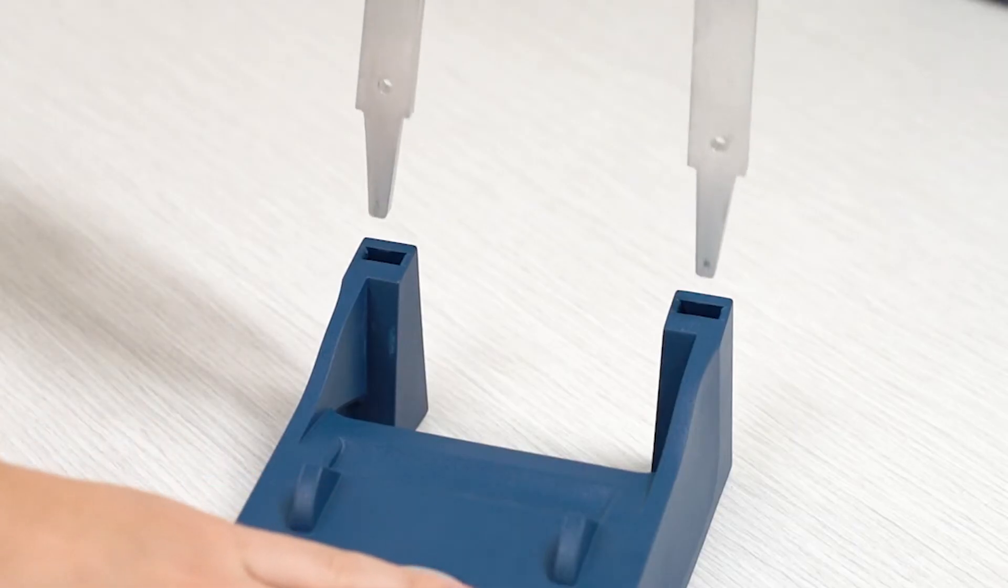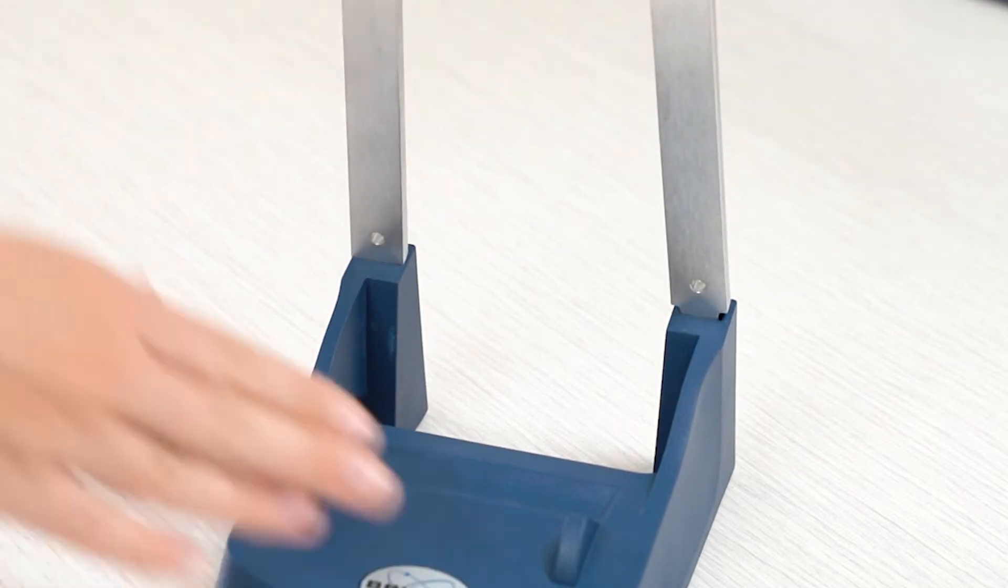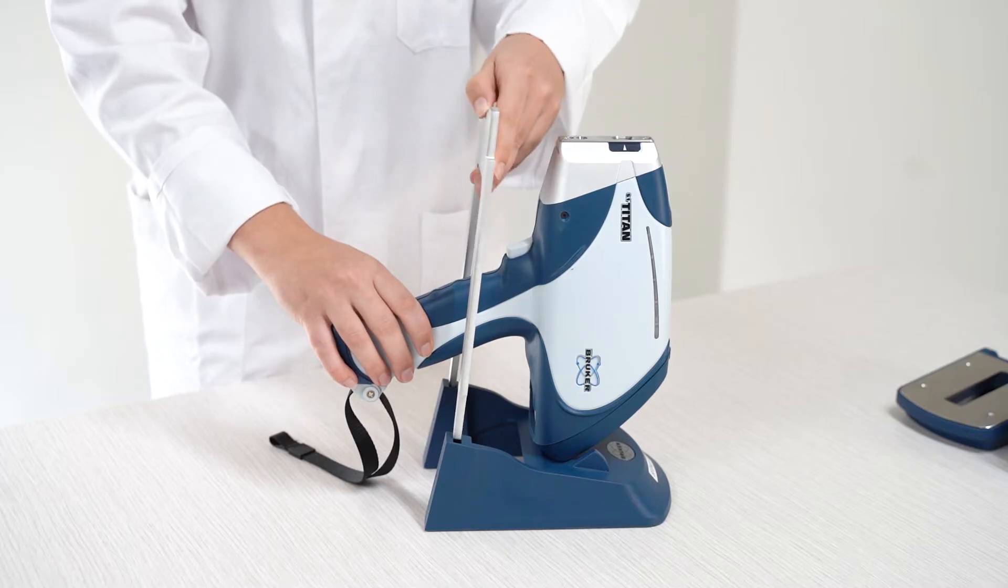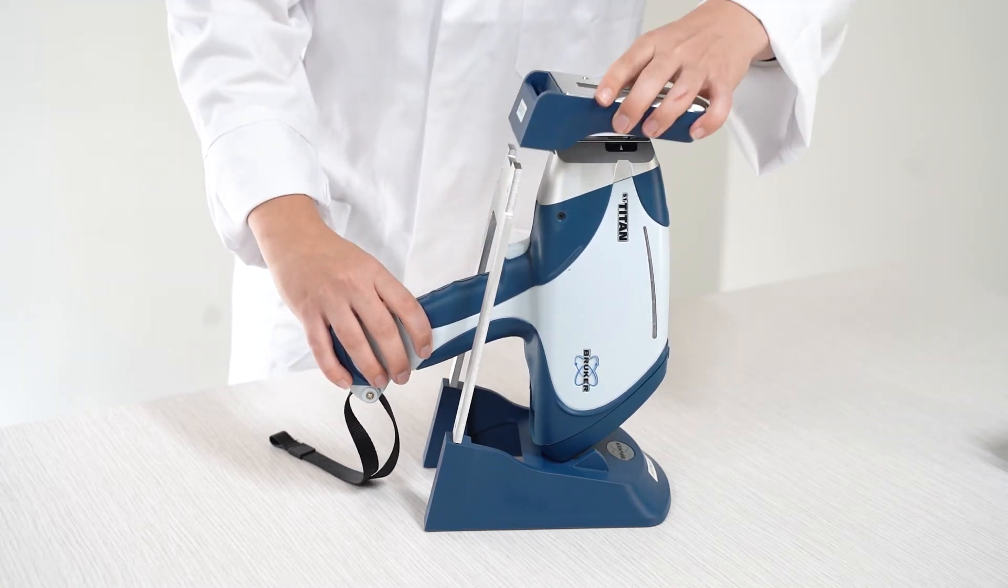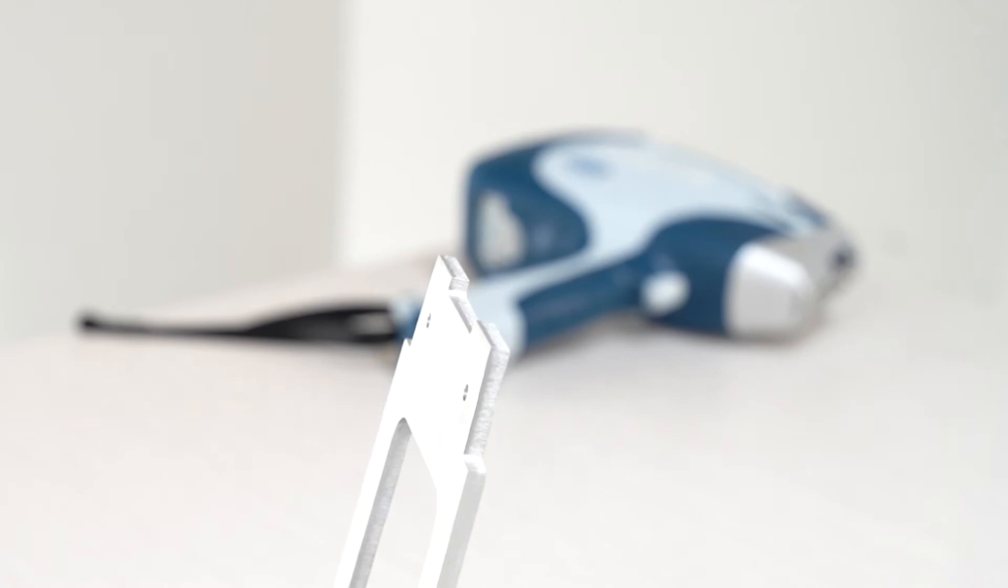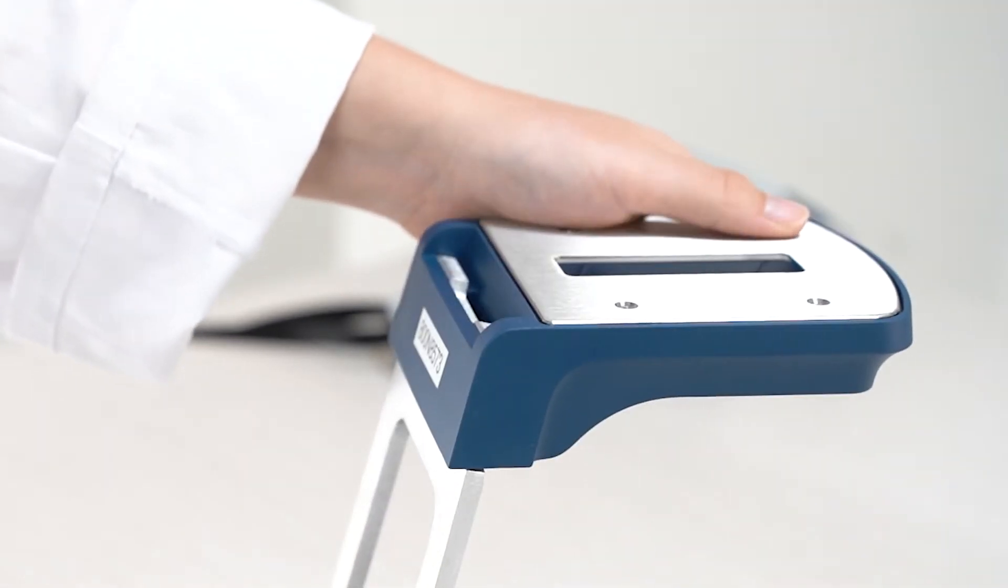Next, grab the metal part and place it into the slots in the blue base. The stage slots into the top of the metal backing. It aligns to fit the analysis plate on the instrument.